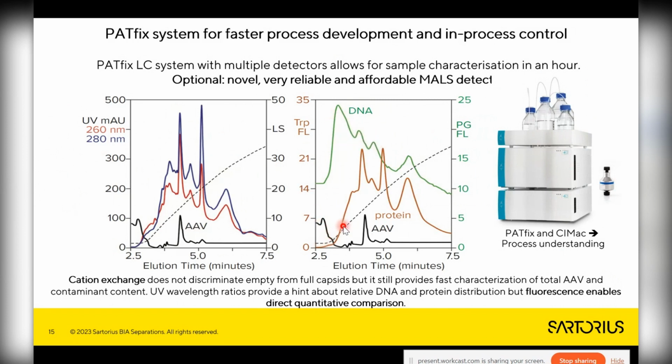And the second channel of the fluorescent detector we set towards tryptophan excitation, so we can boost the sensitivity for proteins, host cell proteins, and so on. So we have an orthogonal method to just using a PicoGreen method or host cell DNA PCR, and also Bradford methods.